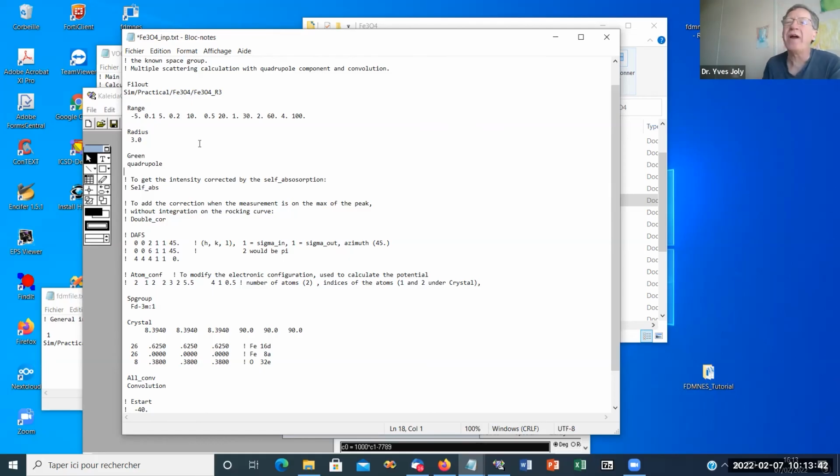If the atoms are not well aligned, if you have some disorder, not exactly disorder because it can be a periodical system, but, for example, a metalloprotein, which you can calculate if you want, but the atoms are not well aligned, then usually you need a smaller radius. It can be sufficient to use only 4 or 5.